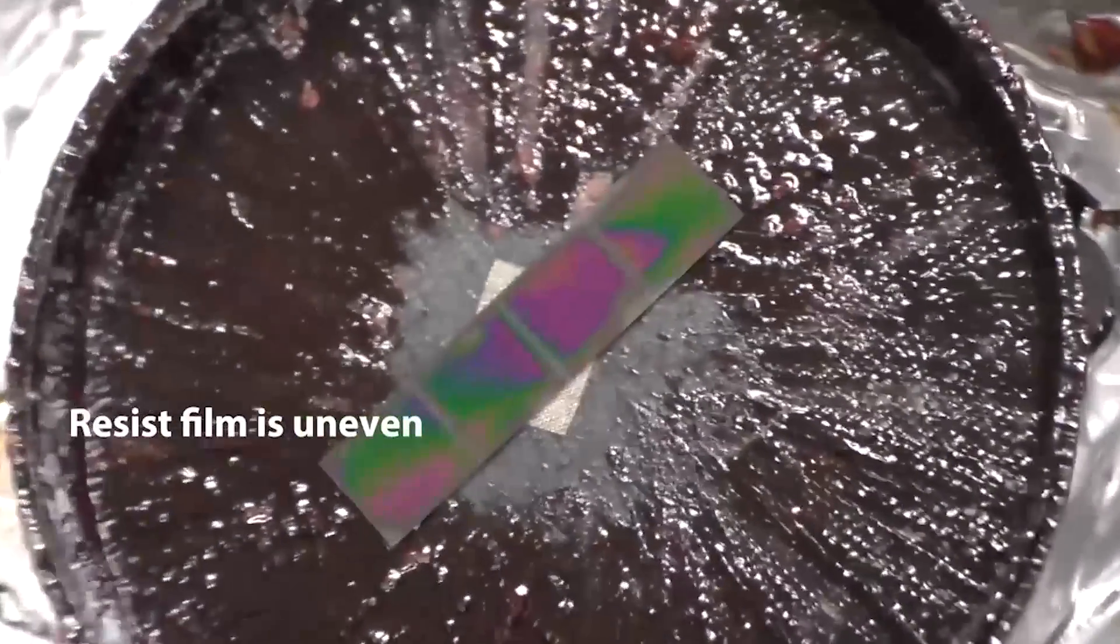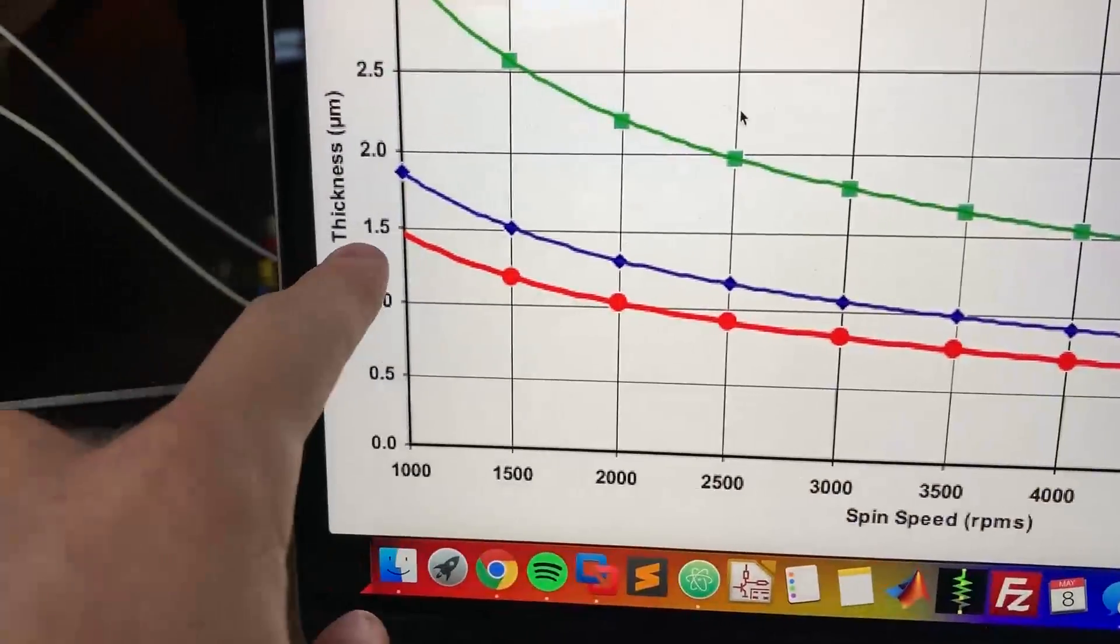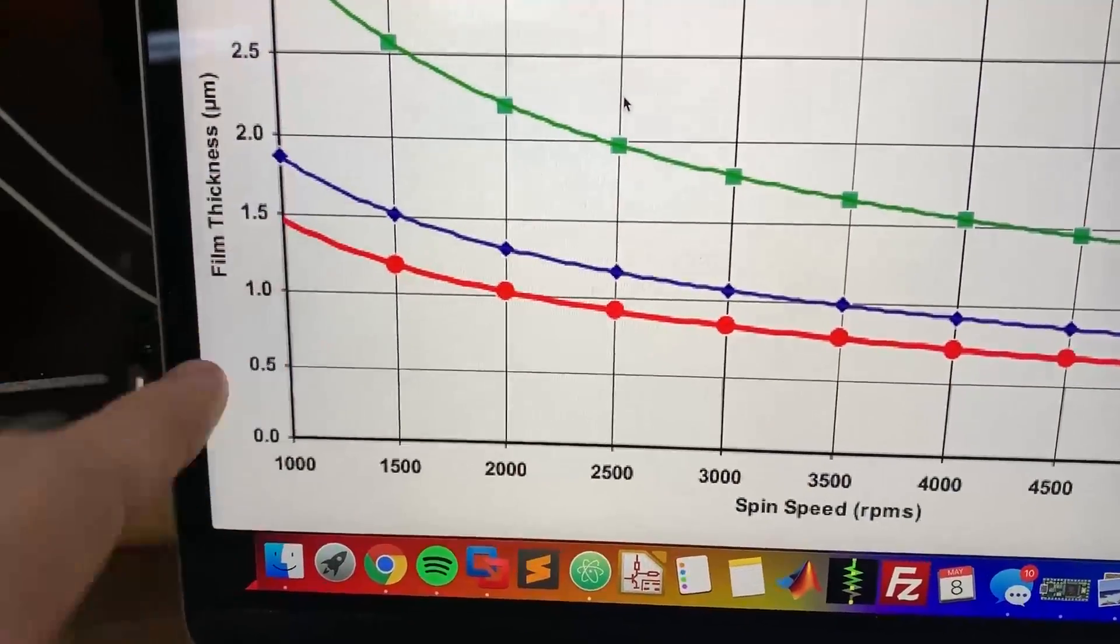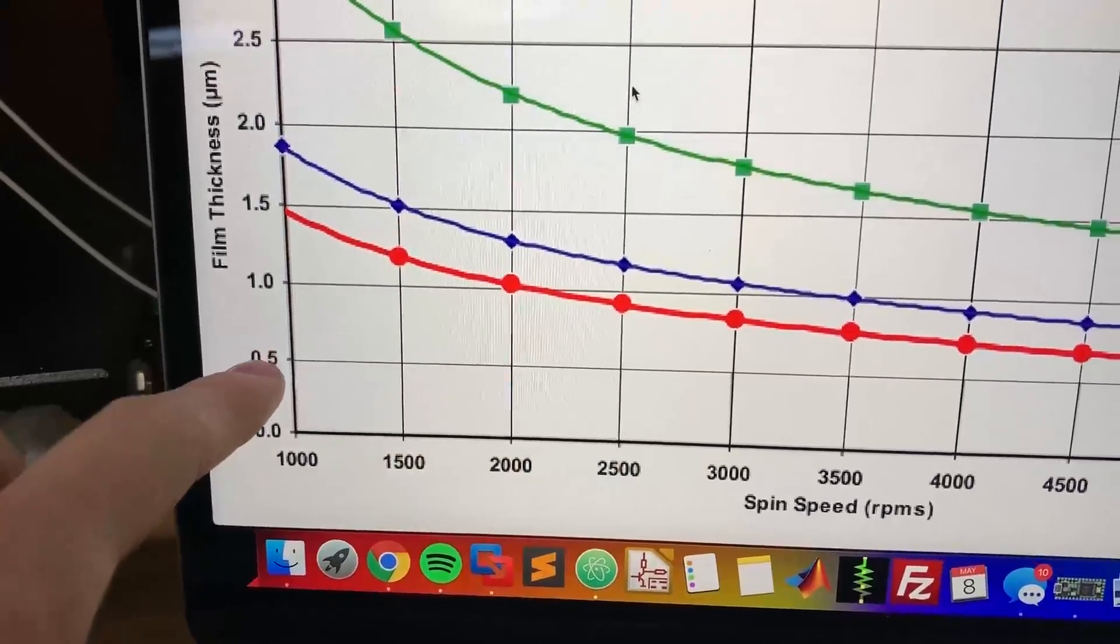In my case I was using this resist in red which is this trace spun at about 4000 rpm which gives a film of roughly speaking here 750 nanometers.